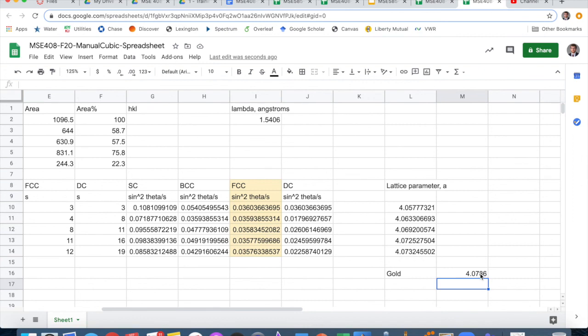So X-ray diffraction is a very important and powerful technique for getting what crystal structure we have and the lattice parameter, but without composition, sometimes we can't make that next step. So knowing the composition would be very important. So just kind of leave it there, that oftentimes we need a little bit more information than just X-ray diffraction. But chances are, if you saw these samples, you would be able to tell which of those three we have.